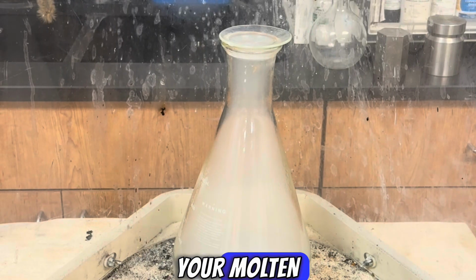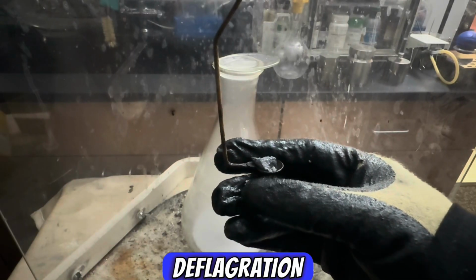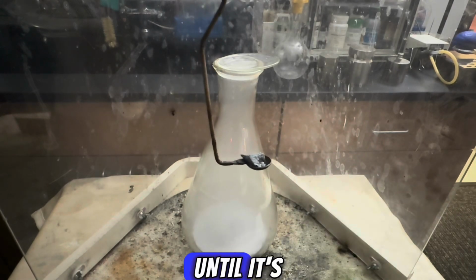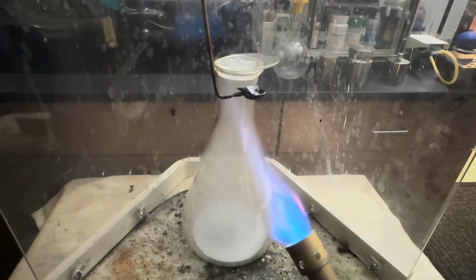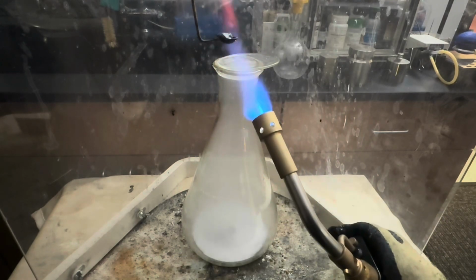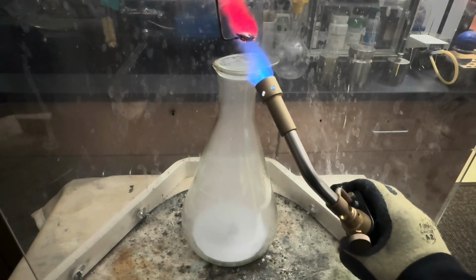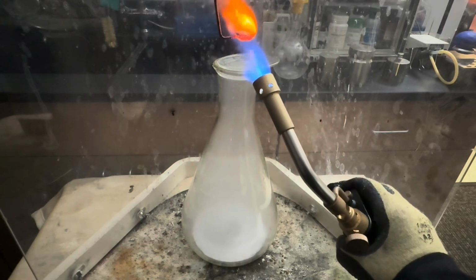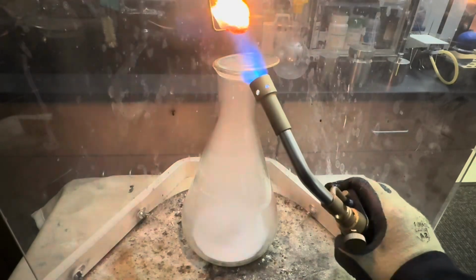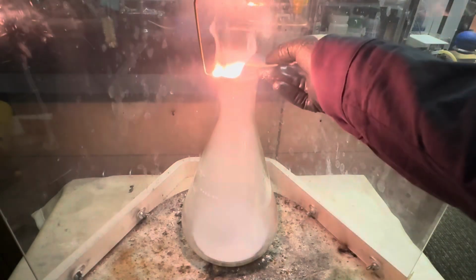Before lowering your molten lithium into the Erlenmeyer flask, put it behind a blast shield over a flame retardant blanket. Now place your lithium on your deflagration spoon and begin heating it until it's molten, and then you'll lower it into your Erlenmeyer flask. All right, here we go.